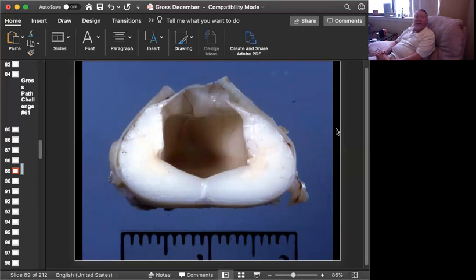Okay, time's up. We're looking at the spinal cord. You can see the dura here. You can see what's left of the spinal cord proper. Here's gray matter here, and we have a large cavity. Okay, I do not see the central canal incorporated in this large cavity.